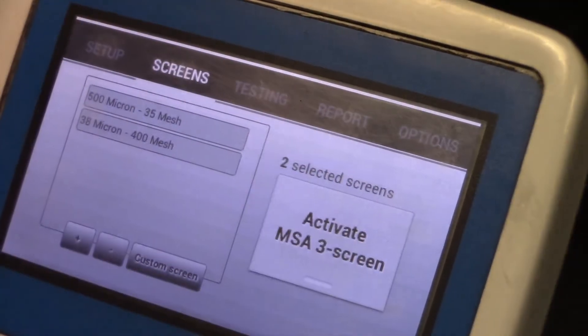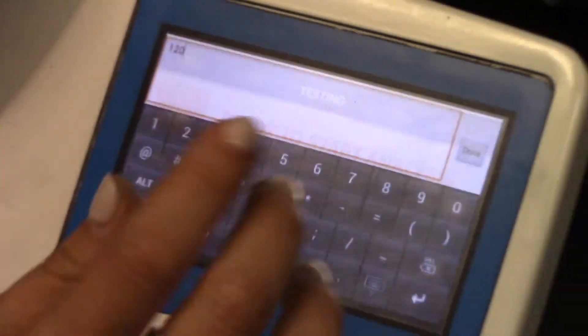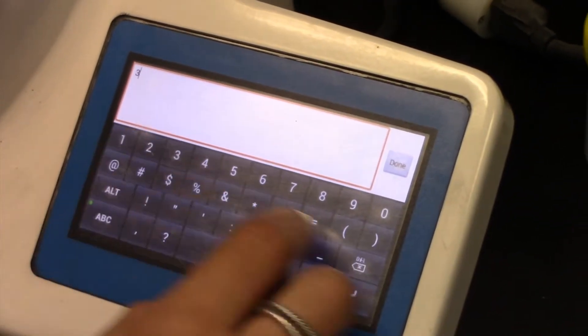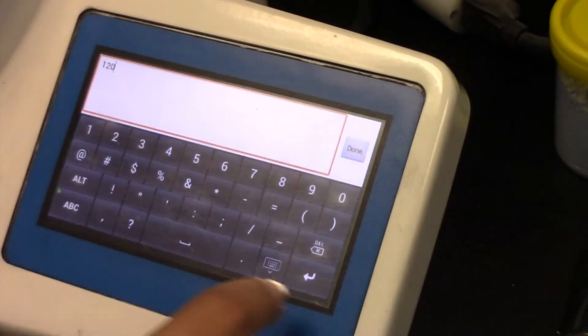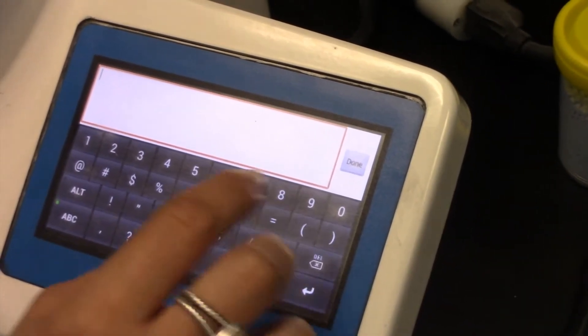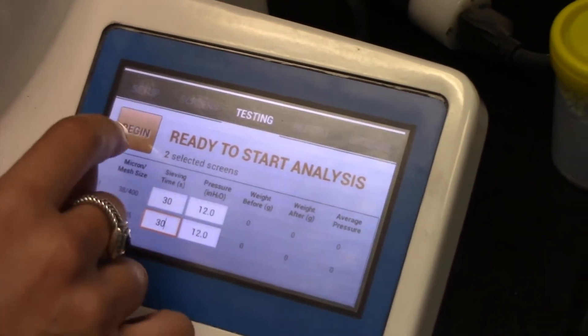From here, go to the testing page. For testing purposes, I'm going to enter in a 30 second sieve time for each sieve screen and I will leave it at 12 inches water pressure for both. Then we're going to press begin.